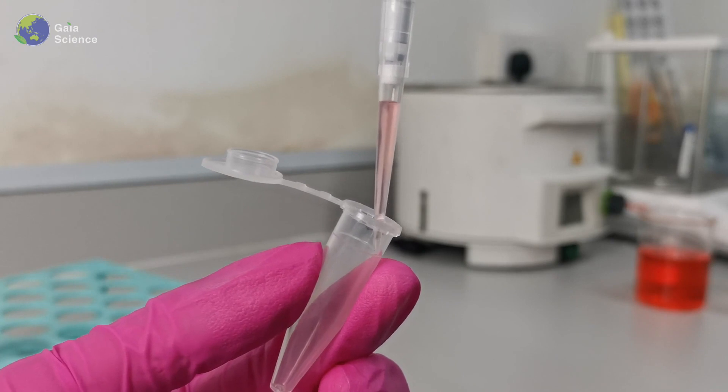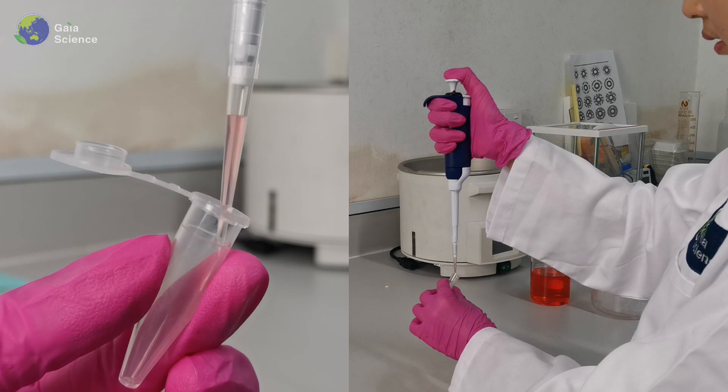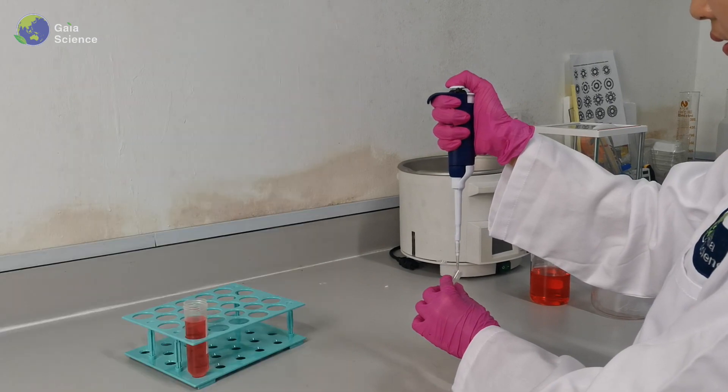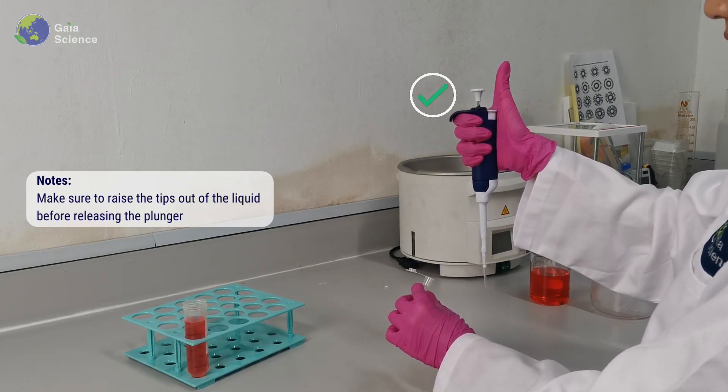To dispense the liquid, the pipet tips should always stay in contact with the vessel wall at a 45-degree pipetting angle. Press the plunger to the second stop to perform a full blowout. Please make sure to raise the tips out of the liquid before releasing the plunger.